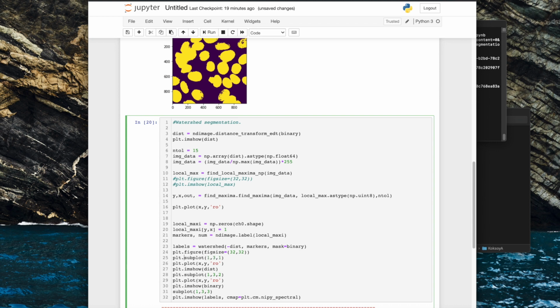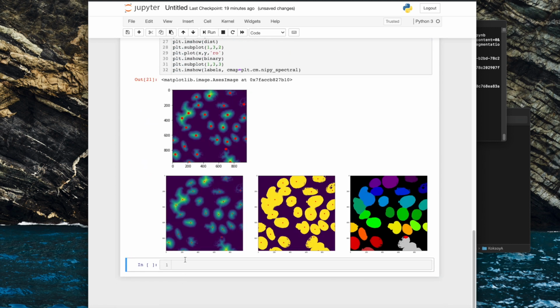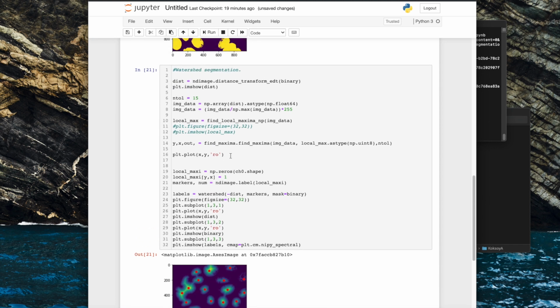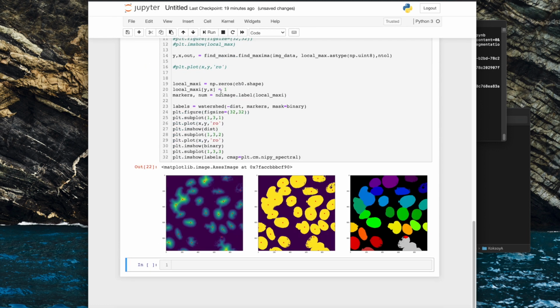Still making mistakes. So actually we can comment this one out for now. We should have a nice row.